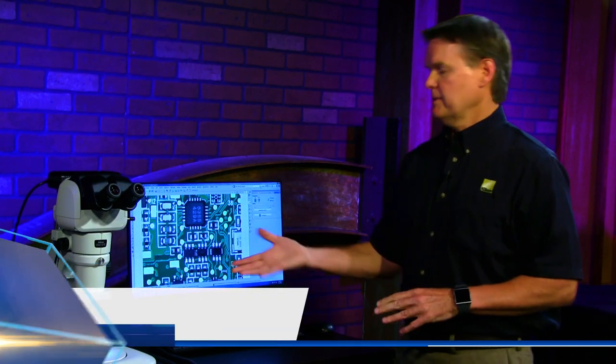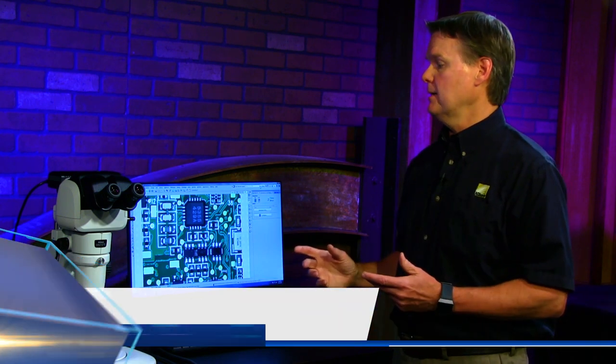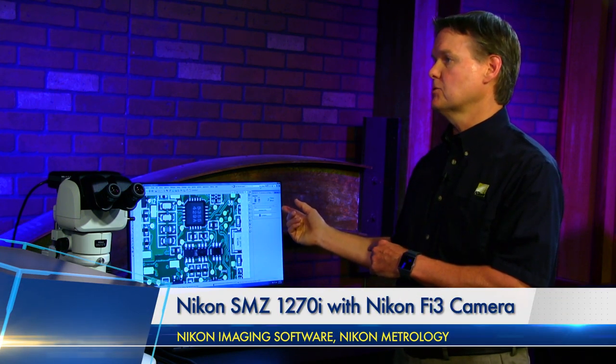These are all manual microscopes. Up until we get to our high-end one, we can get motorization on the zoom and focus. But this one is manual focus and manual zoom. However, the 'i' stands for intelligent—we can hook up a USB cable to the zoom body to the computer, and through our Nikon imaging software Elements, it'll keep track of what zoom level you're on. We have a dual nosepiece so you can switch back and forth—in this case a 1x and a 0.5x—and the software keeps track of what lens you're on as well.